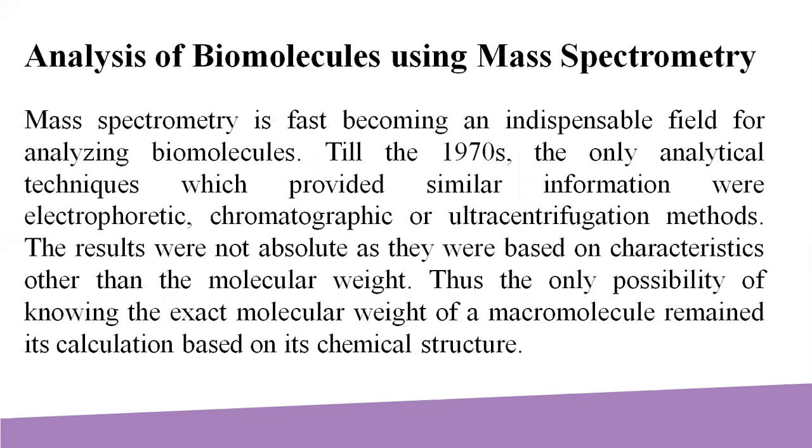Analysis of biomolecules using mass spectrometry. Mass spectrometry is fast becoming an indispensable field for analyzing biomolecules. Till the 1970s, the only analytical techniques which provided similar information were electrophoretic, chromatographic, or ultracentrifugation methods. The results were not absolute, as they were based on characteristics other than the molecular weight.